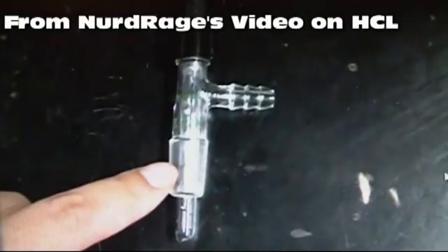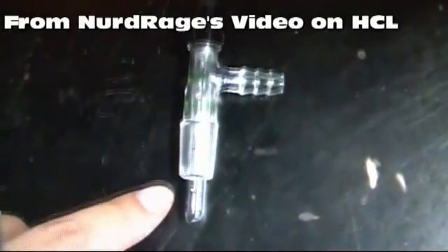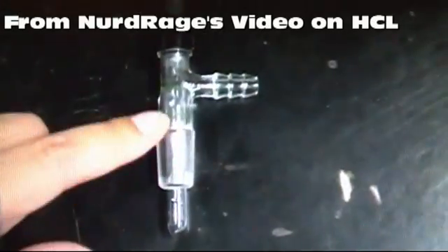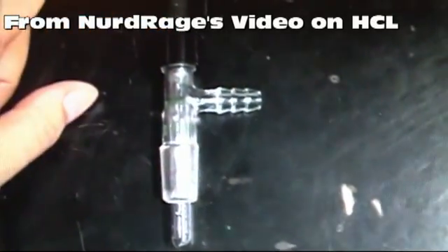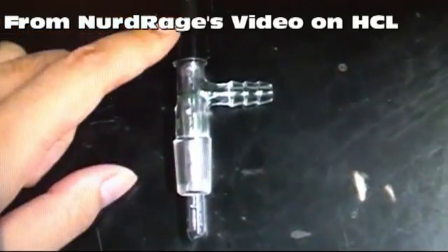Hello everyone. In one of NerdRage's videos, he uses a backflow preventer to keep his newly made hydrochloric acid solution from being sucked back into the reaction flask due to the high solubility of HCl and the pressure change from a cooling reaction flask.